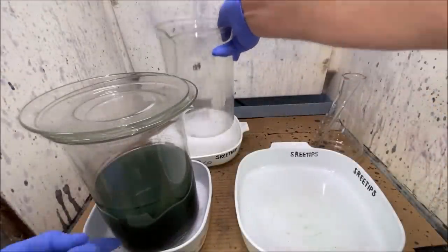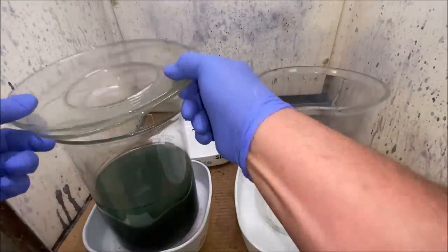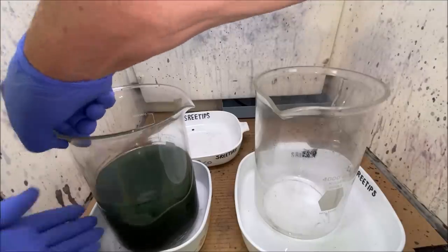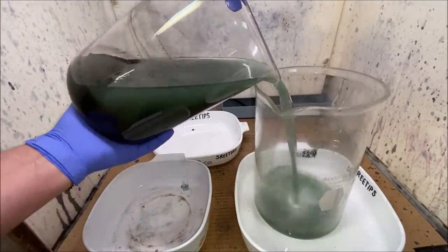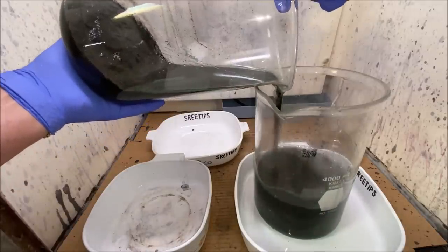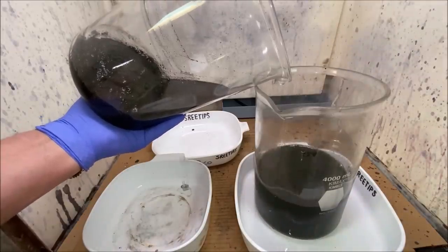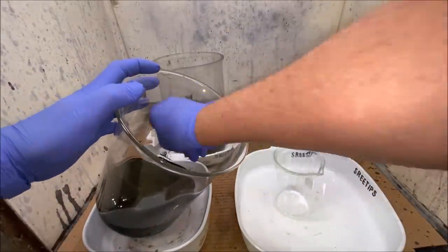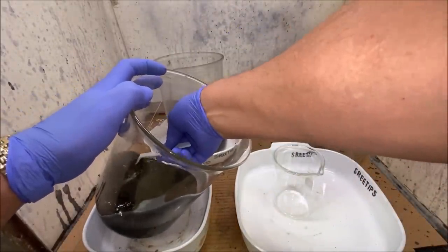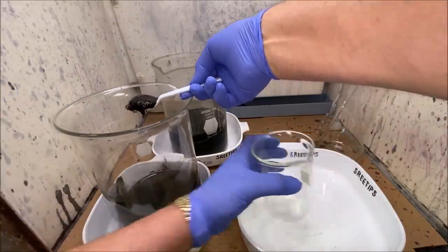All right, I'm going to need to get at some of this solid material that's down in this beaker. So what we'll do is we're going to transfer the liquid out of there into this clean beaker, or this empty beaker here. I'm going to reach down into our solids and get a little sample of it and move it over here to this clean beaker.